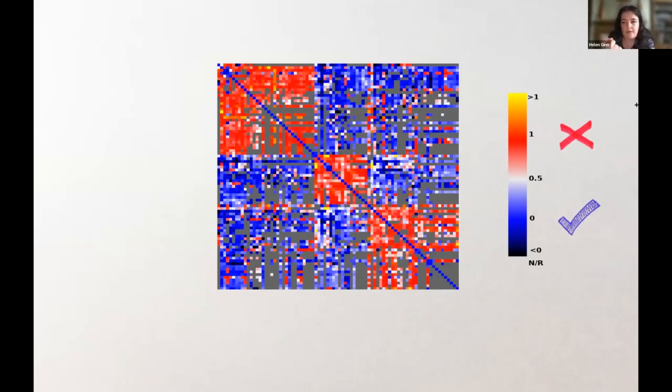But what we really want to know is where every single antibody actually binds on the receptor binding domain. And this is quite an undertaking, but during the course of this work, Helen, a different Helen, Ren and Daming in the lab were collecting structures of individual antibodies.